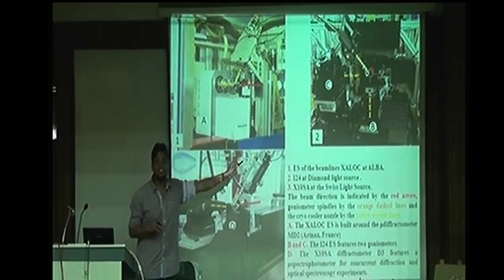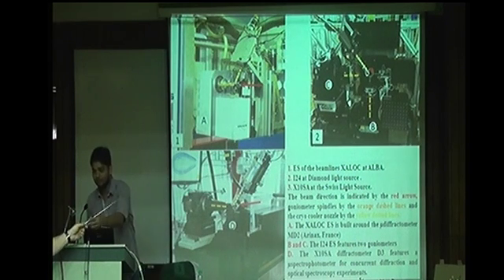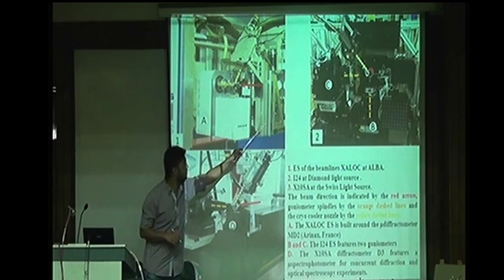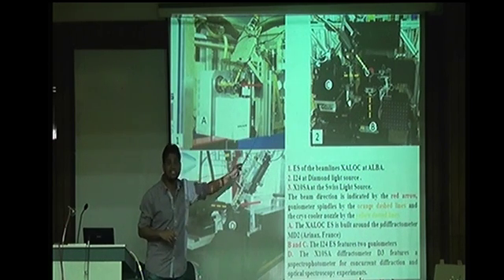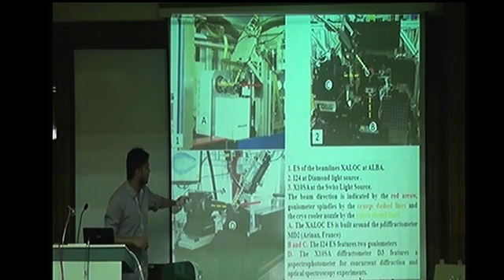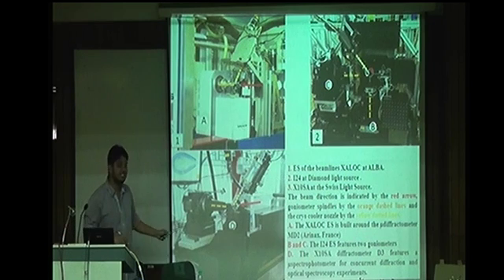B is the principal goniometer spindle, and C is the horizontal secondary goniometer. And at the Swiss Light Source, this D is showing the spectrophotometer.